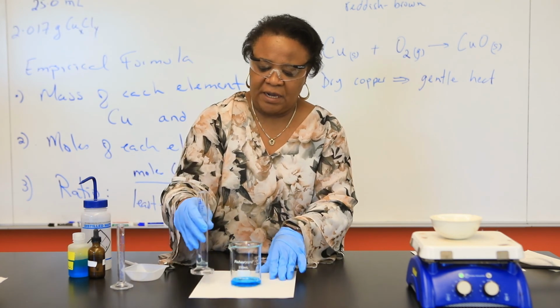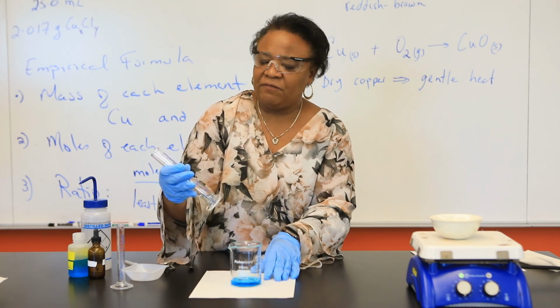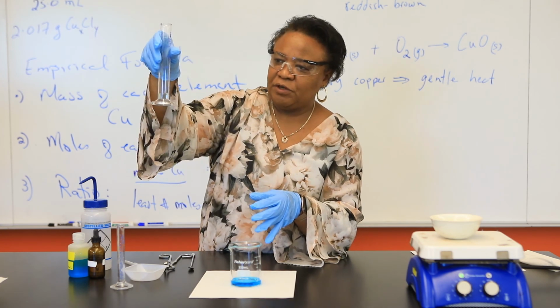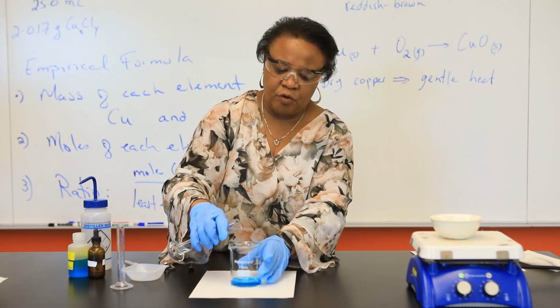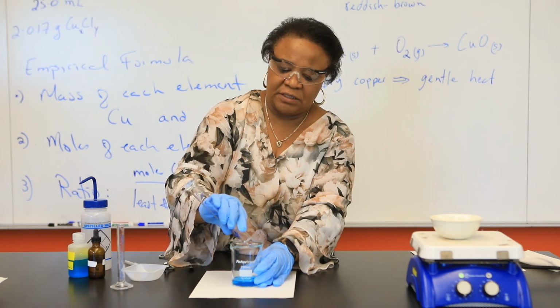And so to confirm that all of our copper chloride solution was transferred, I'm just going to be rinsing this graduated cylinder with approximately 5 mLs of water. That is making sure, notice, it still appears to be slightly light blue in color, so that I know that there is a small amount of copper chloride solution still remaining in that grad cylinder.